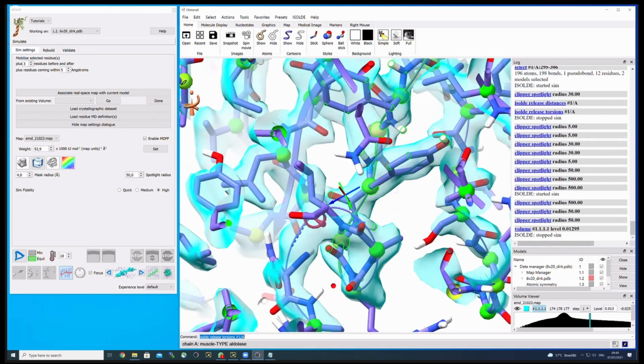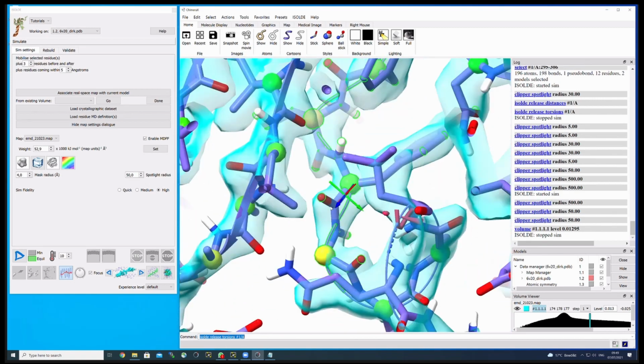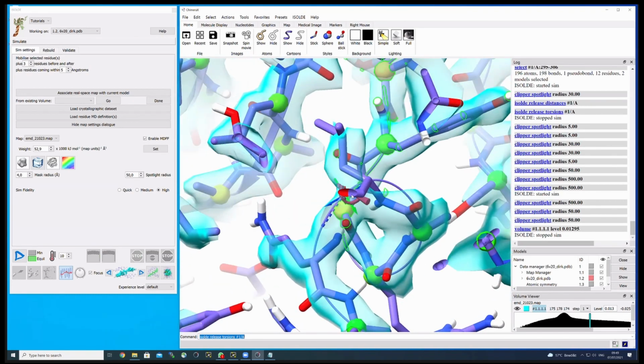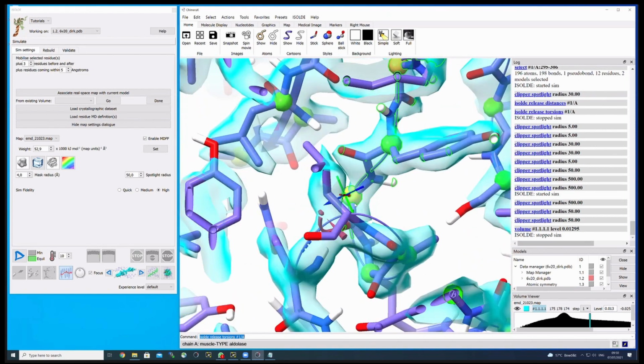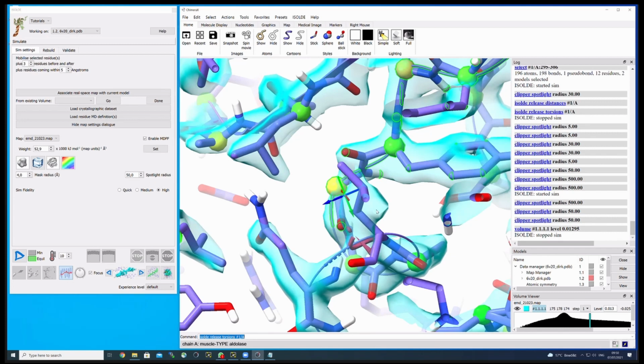I've seen Biao doing this in the last days here. Must say I'm very happy to see that he succeeded actually building one of the copies de novo to very high quality already. So I think with the tools that you have at hand now, you can certainly start getting into model building with this high resolution map.